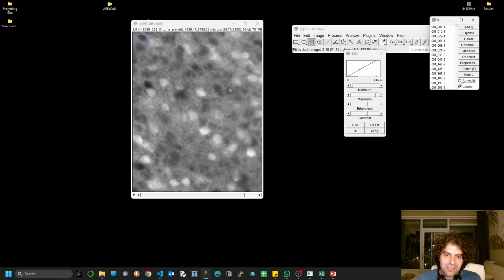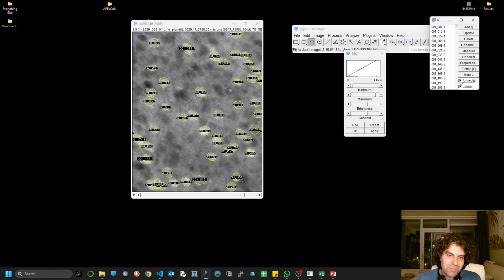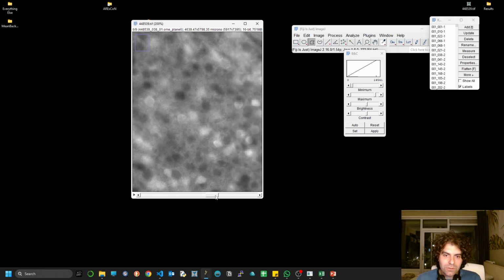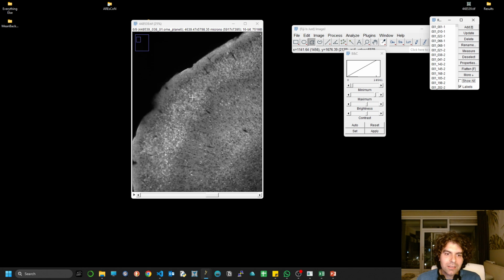Okay, yeah, it starts to take shape, but it's not that apparent. Here it says it's 6. Let's go to 6, and indeed, oh yeah, here comes the 6. So you see, that's the power of this pipeline.